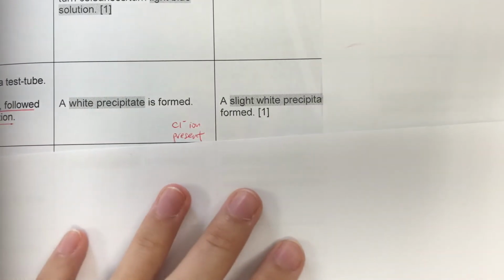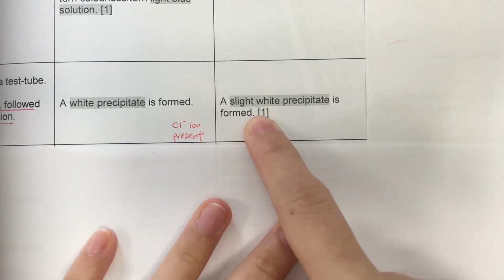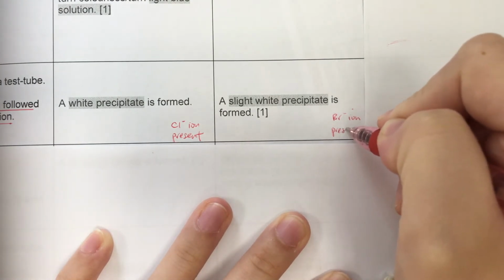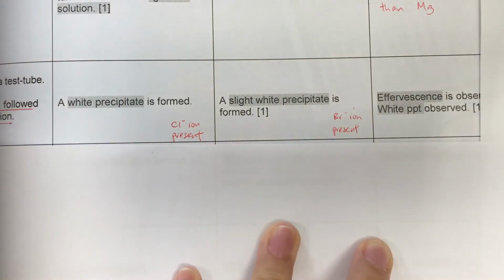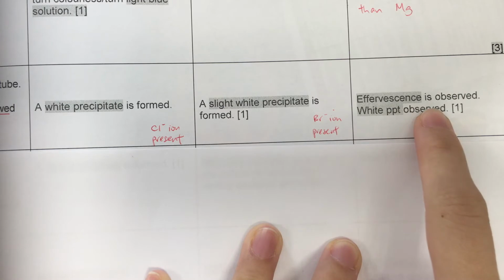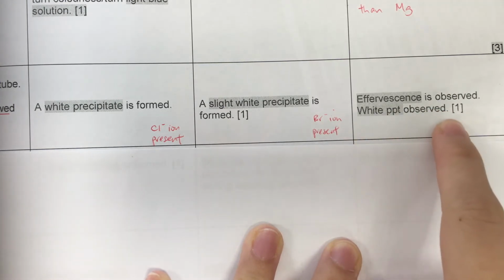Okay, the next one, if you realize the color is not really white, but it's a slightly white precipitate. So this you're not expected to know, but for information as well, it could be bromide ion. The more practicals you do, the more you recognize that bromide ion could be this color. And finally, because there's acid added, it could be a reaction of acid with perhaps metal carbonate. So there's effervescence, and here there's also a white precipitate observed.